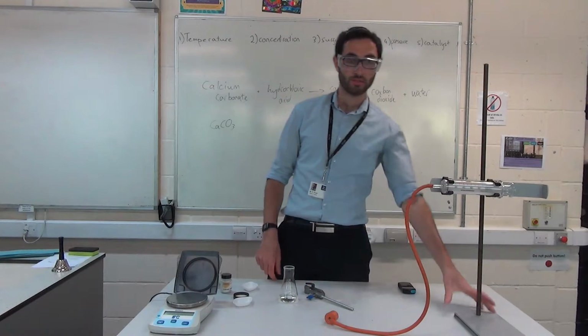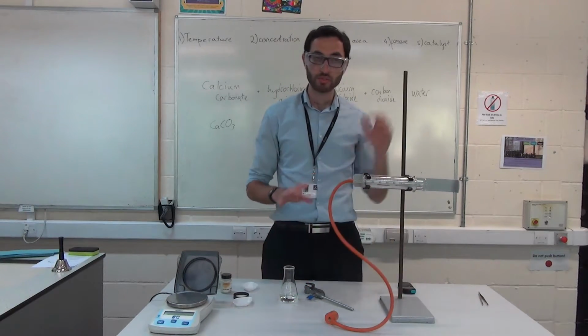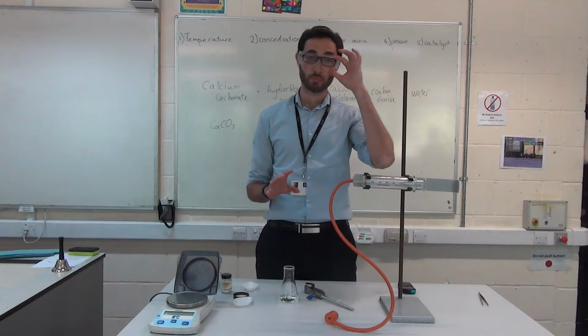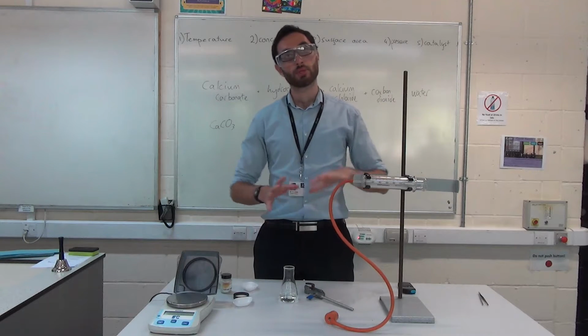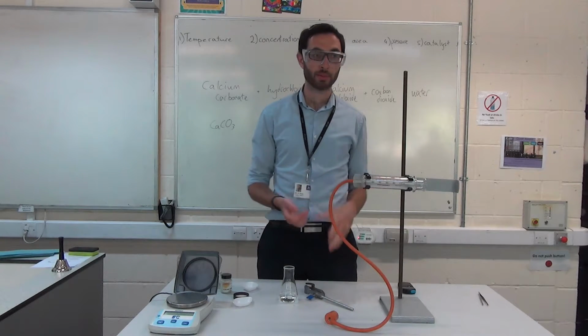Okay, my next one is very, very similar to the last one. It's just a different way of collecting the volume. So the previous way was collecting it underwater. Now that's a great technique, but the problem with it, you can get water everywhere. It can be a bit difficult to set up.